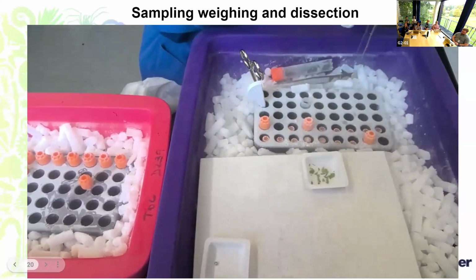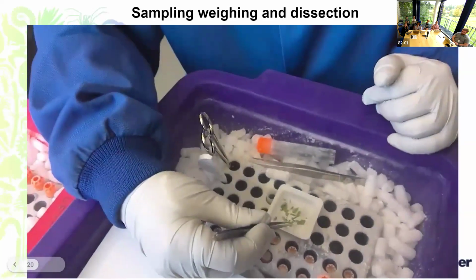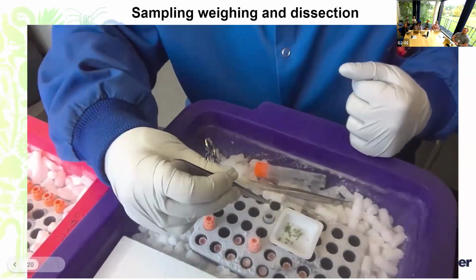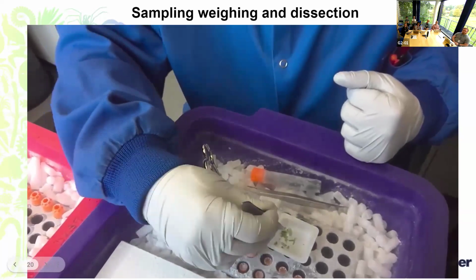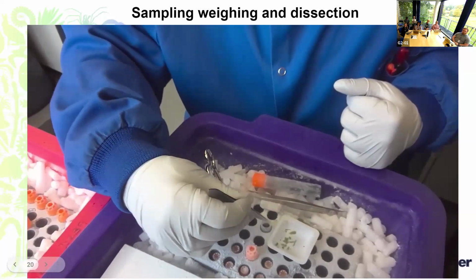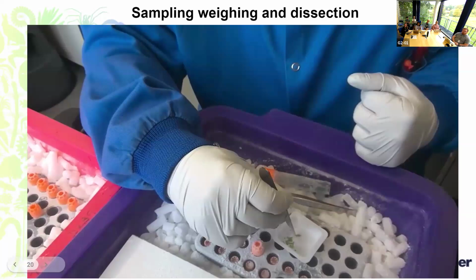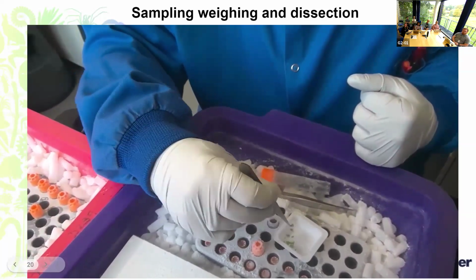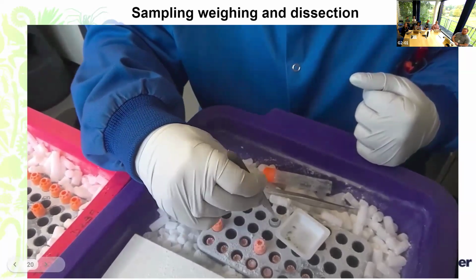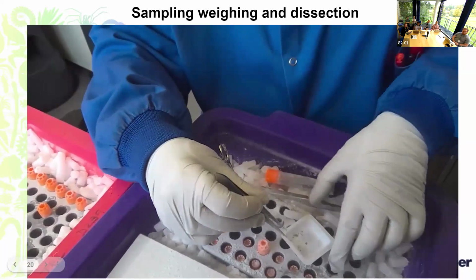Now the sample is being transferred into the tube where we have the stainless steel beads. From here on, it will be processed as a batch. So we can bead 48 to 96 samples in one set. While Liz is showing the process, she'll explain a bit more on how many samples can be processed at one time, what are the different tubes we use, and the different beads that can be used for this entire process.